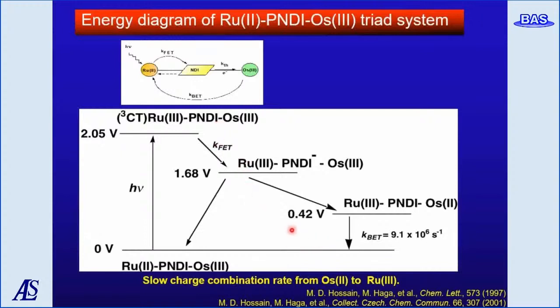the starting state. Thus, the determination of the potential of the photoexcited state is very important to consider the driving force of the electron transfer process, and is also the key to controlling electron transfer and energy conversion.